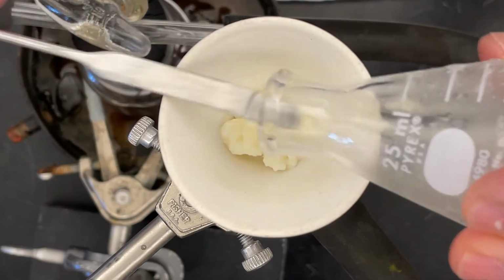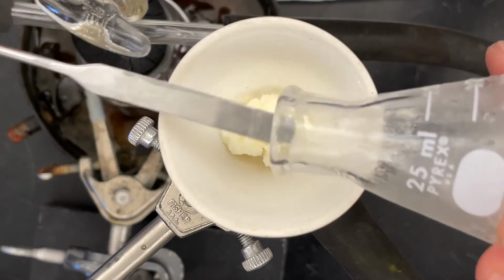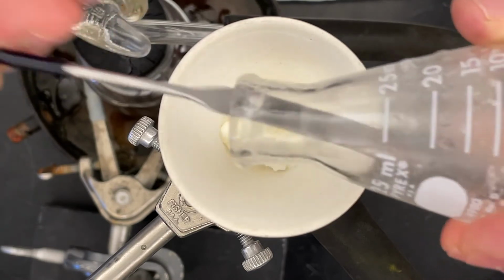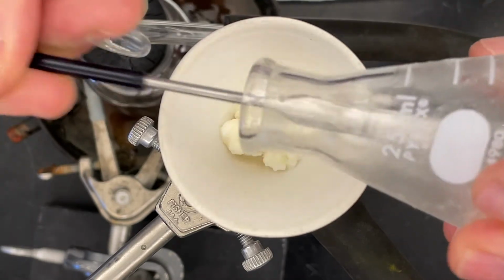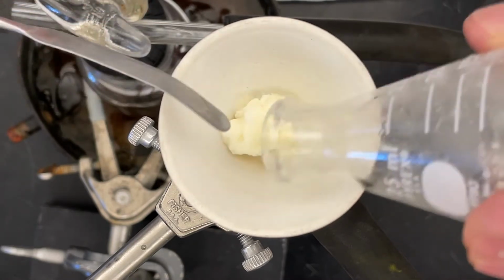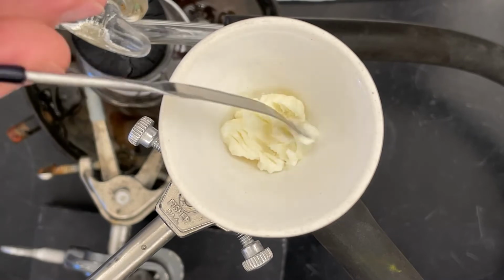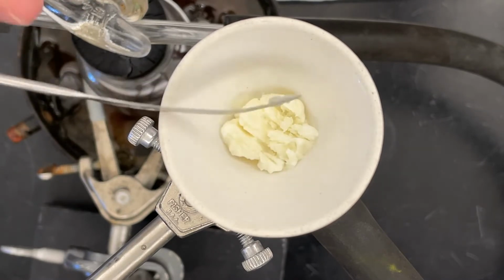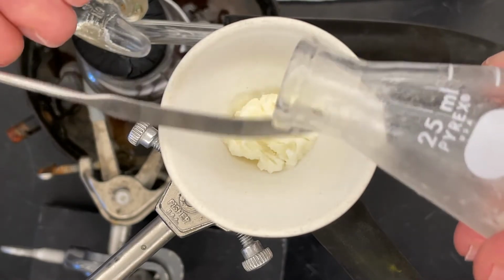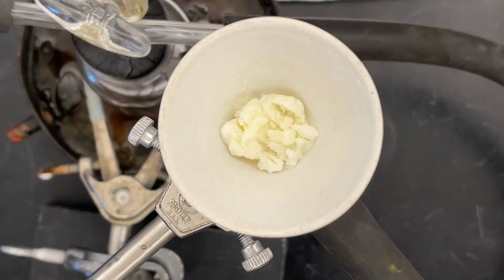We can rinse this with quite a bit of water, and in fact we do want to rinse this with quite a bit of water because we want to rinse all of the thiamine and sodium hydroxide out of our organic material, and you'll see that the color as we rinse it is already starting to change. As it filters, it's turning white. The yellow is really the solvent, and the thiamine that was reacted with the sodium hydroxide. So we'll rinse this now with a little bit of water.